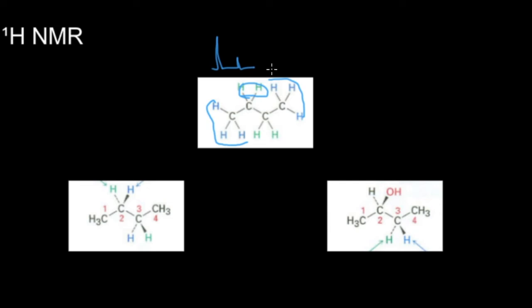And you can see that there is a symmetry line here. That's why these atoms are the same as these atoms and they will give just 1 peak. Alright, and in this example you can see that actually these 2 atoms give 2 different peaks in the spectrum, and the reason lies in the stereochemistry of this carbon atom.